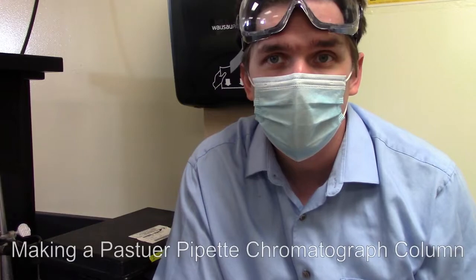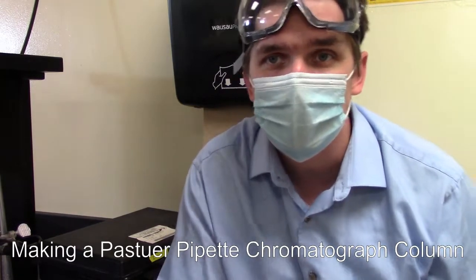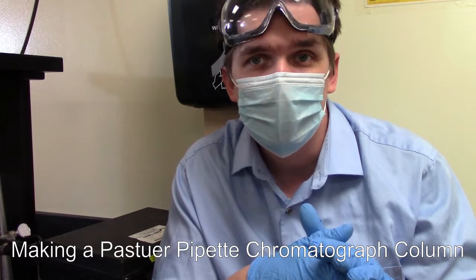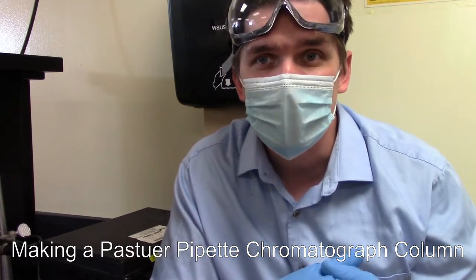In this video we're going to talk about how to pack a Pasteur pipette in order to do a simple column chromatography. Now I'm going to break this video into several sections, mostly because there's a lot of camera rearrangement to make this visible to you.